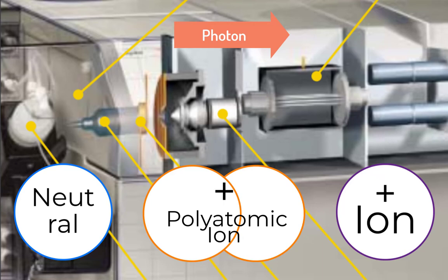And behind this cone, there's a vacuum. So the ion or the sample stream will actually be sucked into the hole as well as just being shoved in there by the force of the plasma. And the purpose of this cone is to skim off, which is why it's called a skimmer cone, all the excess stuff. So anywhere that's not the hottest part of the plasma has a much higher likelihood of having these undesirable things such as neutral species and polyatomic ions. And there's other things as well, but these are the basic things that we worry about.